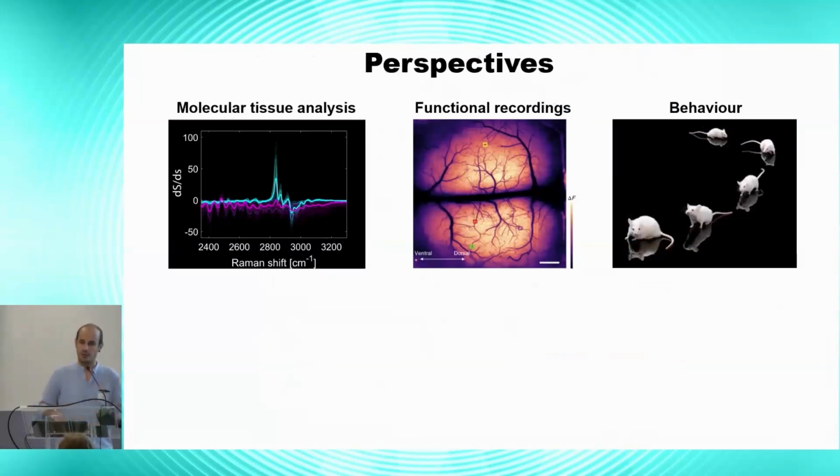wide range of variation in the composition of the tissue, and the idea is to couple the possibility of label-free optical molecular analysis together with functional recordings, and then jump to the behavior. So this is a few years' work for now.